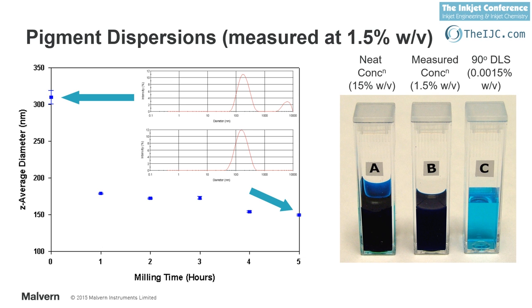But then the second part is looking at that decay in the correlation function and applying a multi-component fit to that correlation to produce the size distribution. In terms of the absolute accuracy of the technique, I don't have the number off the top of my head, but the combination of those two analyses gives good confidence in the results that we get from dynamic light scattering.